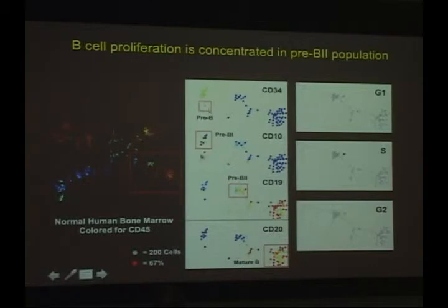While maybe only 98% of what I'm showing you here and calling a pre-B1 probably fits most people's criteria, it's a much easier way to look at this amount of data.